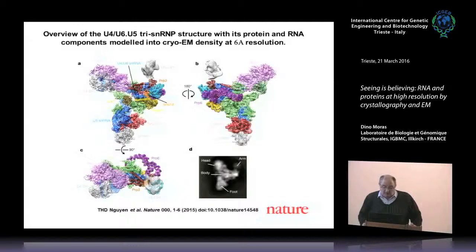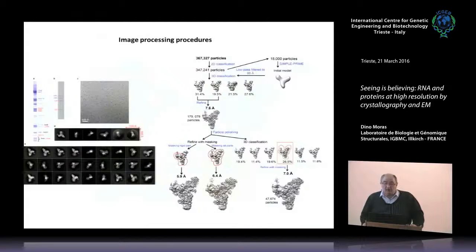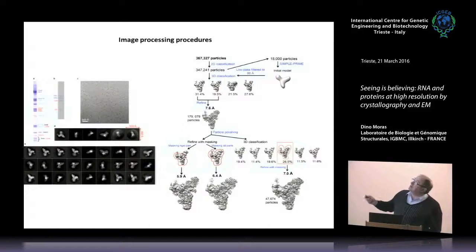Now, this one is the last, just a few months before January. It's 2015, the group of Kiyoshi Nagai, and this is what the real information was. And the imaging process that was provided is interesting. If you are interested, you should go. You don't get that in the main paper, you have to go to the supplementary material, but it provides the data and image processing, the same as what I showed you before. Data, a first screen for the 2D projection. You see it's not right, but much improved.